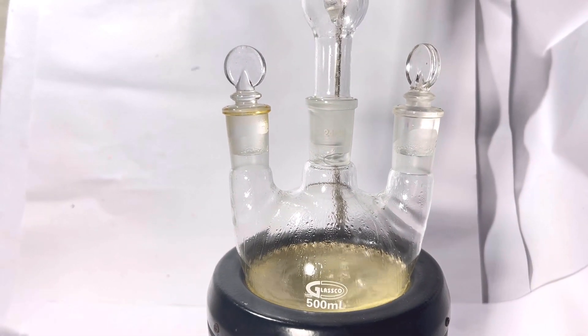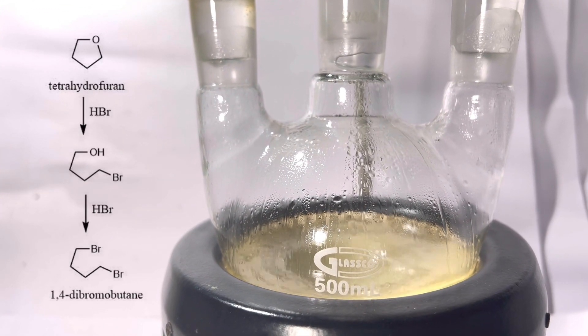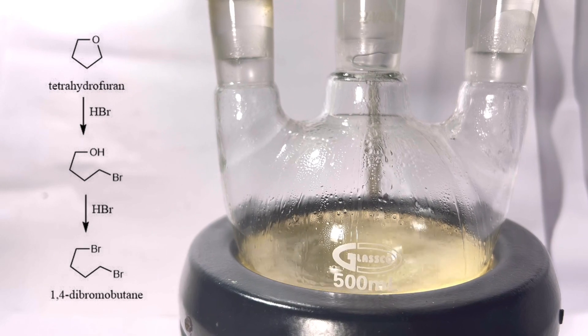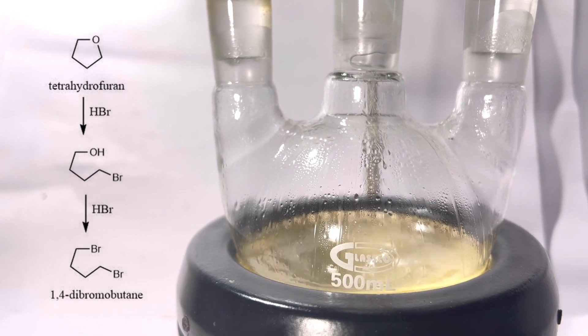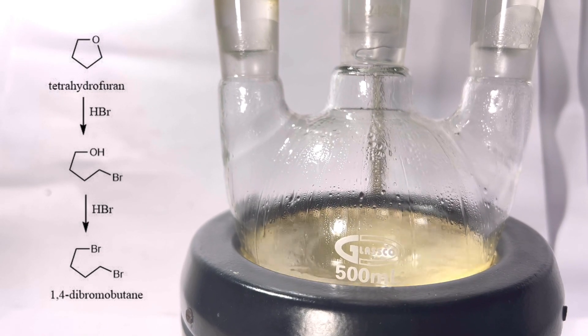Let's quickly see the reaction here. The ring structure of the molecule is broken up to form a straight chain molecule. This can be called a ring opening reaction and it takes place with sulfuric acid and excess of hydrobromic acid.